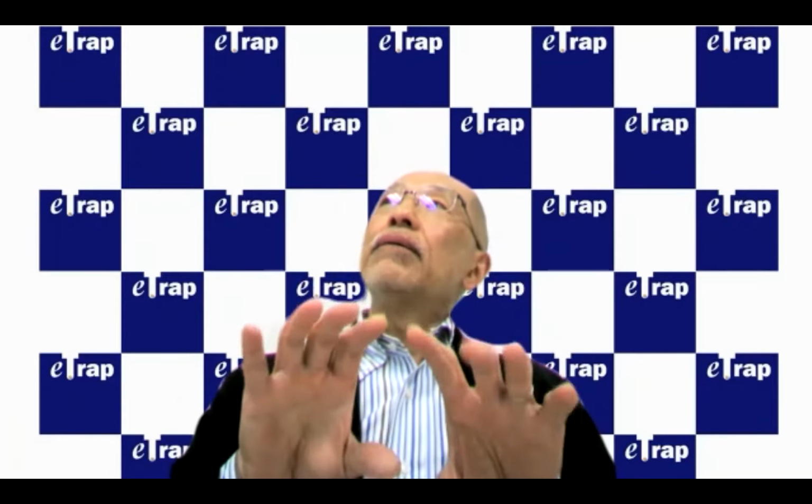And for the narrower band gap, the narrowest one in our experience is tungsten oxide, 2.24 or 2.5 electron volts. That is okay, and very good patterns are obtained for such material.